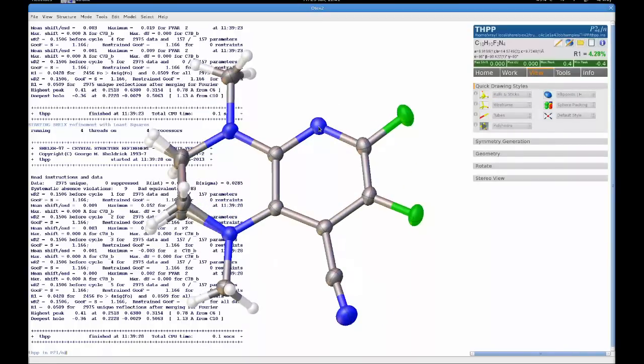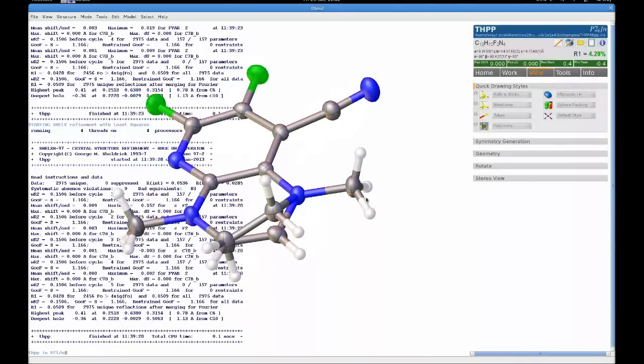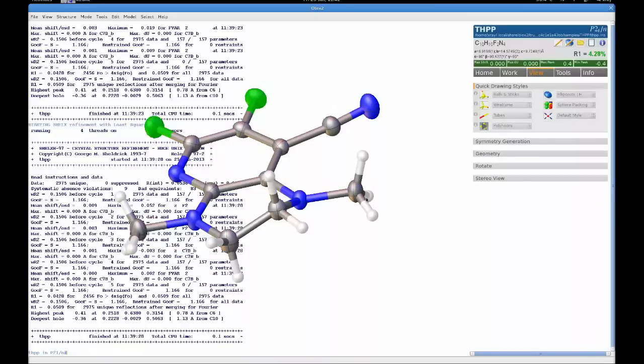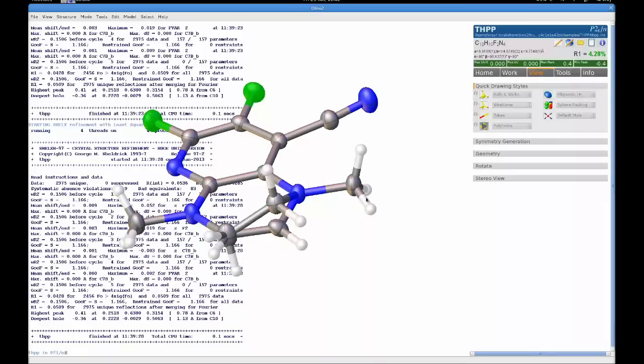So if you ever want to get back to your starting point, you can type fuse, and that will clear modifications like chemdraw and take you back to your asymmetric unit. Now this structure has disordering, and I'm just going to do a quick show P. You can do show P 0 and 1, so you can show the parts. I'm showing part 0 and part 1, but I could show part 0 and part 2. Or I could just show part 0 and remove the disorder completely, and then I can always type show P to put it back on. Now that's just easy and simple.